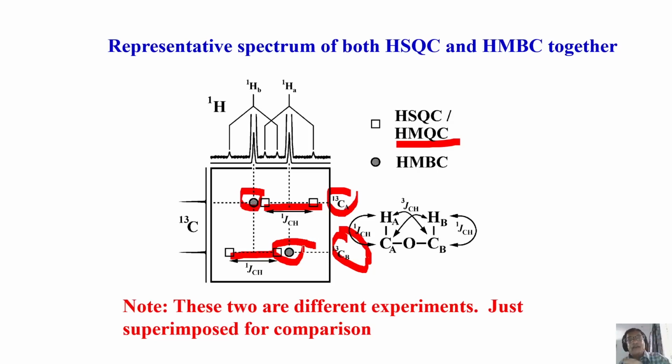INADEQUATE is to get carbon-carbon correlation, with carbon at natural abundance. Most of the time you don't require that. So I don't think I have time to talk about it. Next, I will continue this with the decoupled HSQC and HMBC. How do you get the cross peaks? And then I will talk about one or two examples of the J-resolved experiment. Let us see how we proceed further.